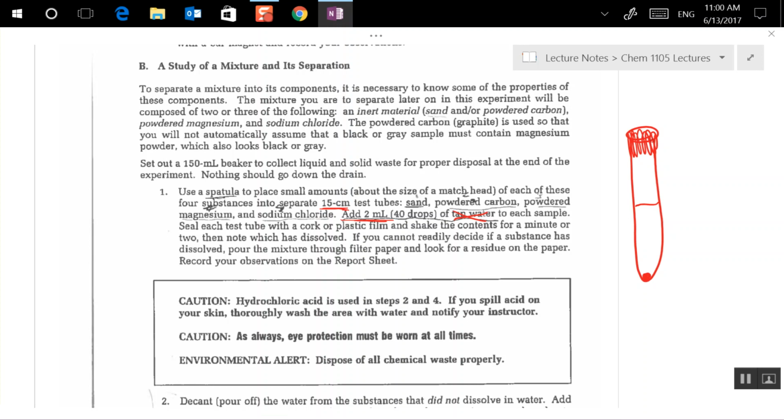Does that make sense? So I pour some water over it, and what's going to happen to the water soluble thing? It's going to dissolve, and it's going to come out with the water, right? It's going to come out with the water, and the other stuff is going to be left behind. And I have successfully separated those components. Okay?